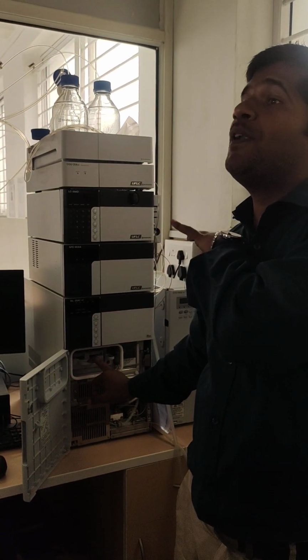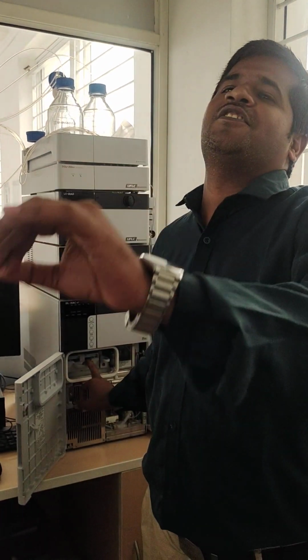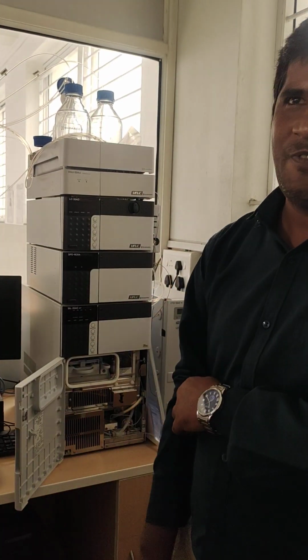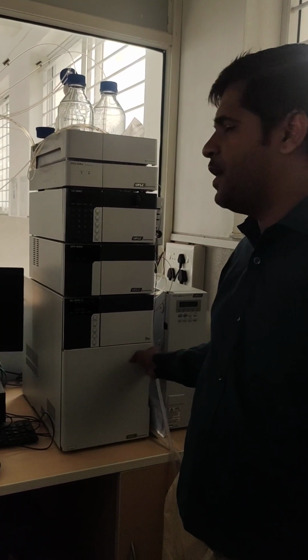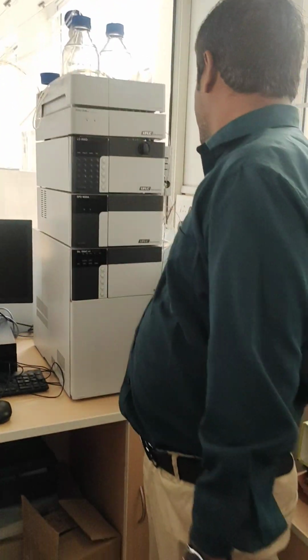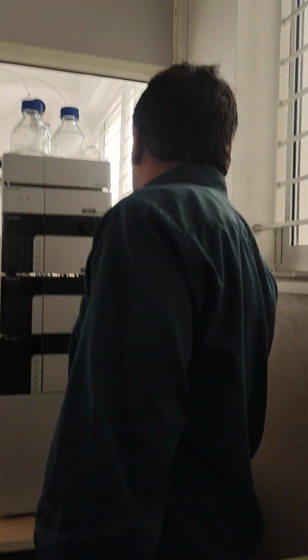So the sample will be retained for at least 1 week. It will not degrade. Some samples may degrade within 2 days if you are keeping them on the bench top. So we have the cooler system and it will retain them for a longer period of time. That is the sample compartment. Now this is the column compartment, and in such a way we have attached the column. Just check it. This is the column.